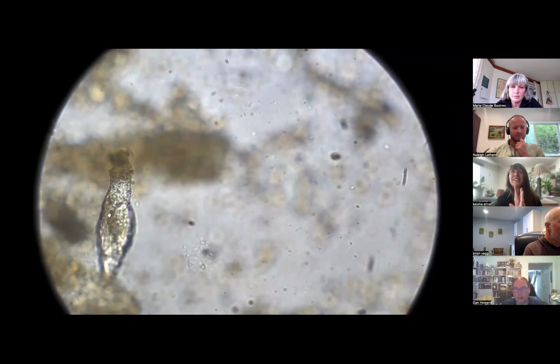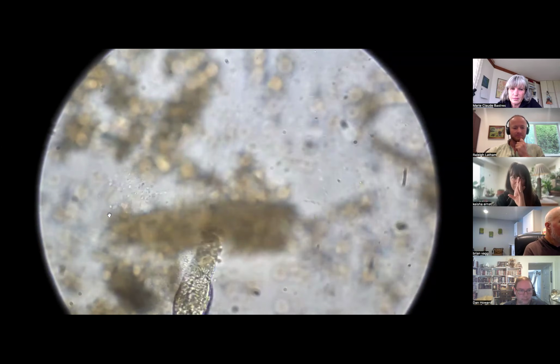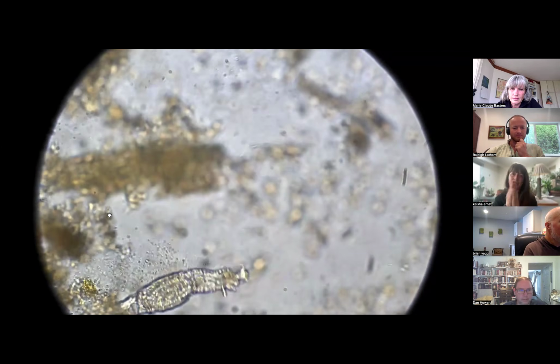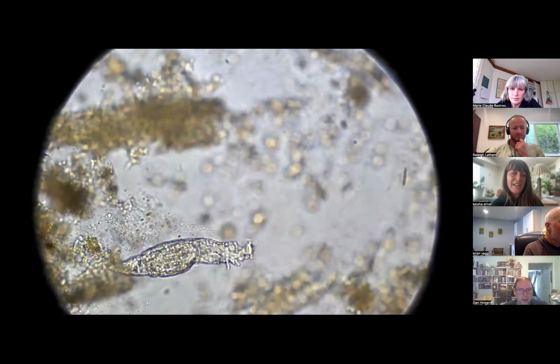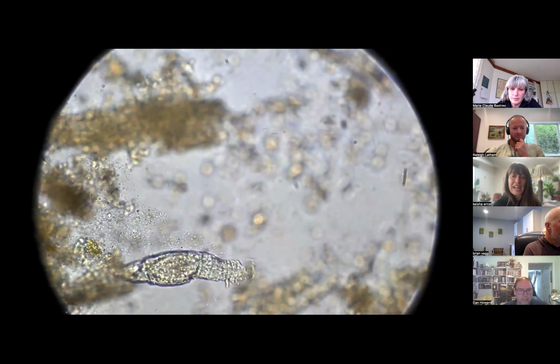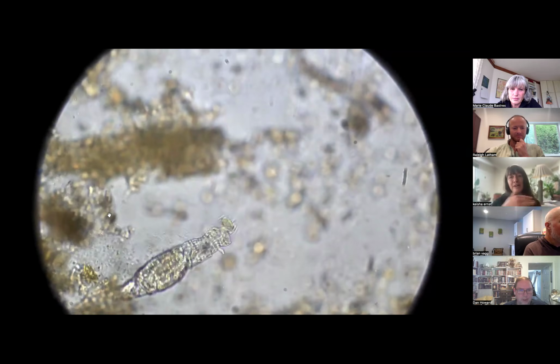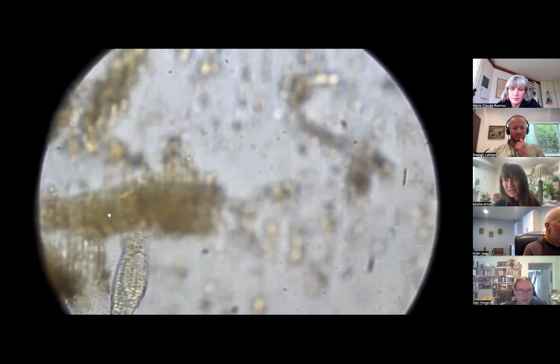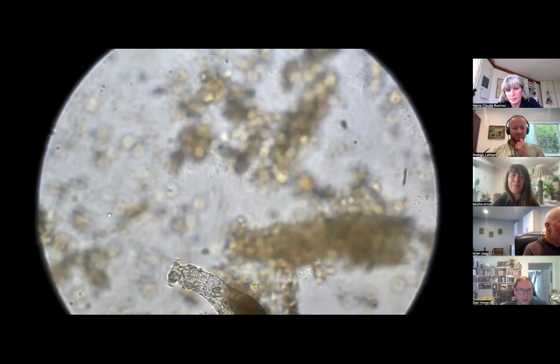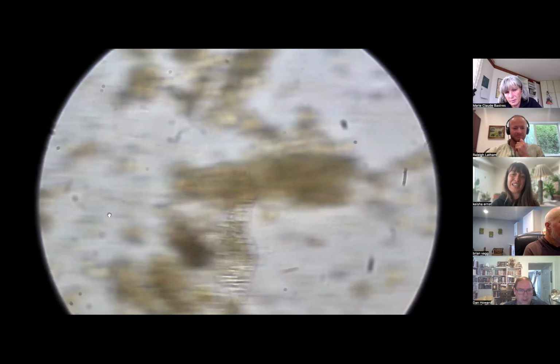So I like to think about aerobic and anaerobic environments. They dwell right next to each other. They're not good and evil. They're the same ecosystem under different influence. Like Brian said, he took the oxygen away from this ecosystem for a long time, and you can see that it's starting to change, but the second he put oxygen in, spirochetes go down and it starts to balance out again. So there's this beautiful balance in nature that's happening all the time between these two zones. So I always see these as a good sign.